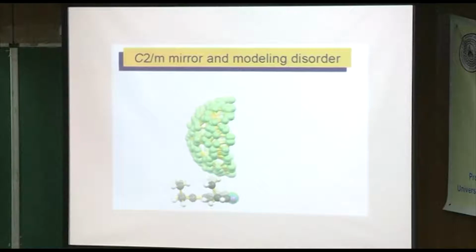So your job is to grow that, to utilize the mirror symmetry, show the other half, and then pick carefully the correct ones that make a reasonably connected fullerene molecule. It's tedious, and it's one reason why we actually build these models with plastic snap-together things so that we can look at the thing while we're trying to do this.